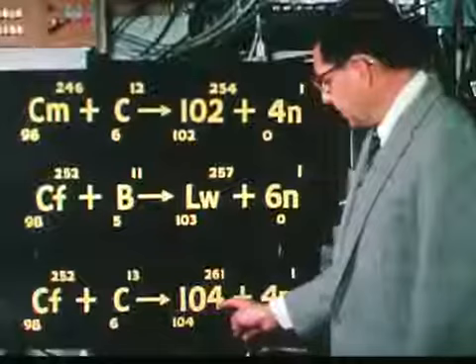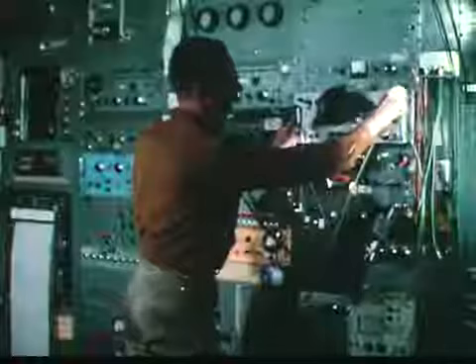The isotope that we will try to find is short-lived, and we will try to detect it in this apparatus. With this instrument, called a velocity selector, and its related electronic equipment, we can detect and record the decay of even a single atom of a radioactive element whose half-life may be so short that it cannot be identified by elution behavior. The electrical impulses from this detector are piped to the counting area where they are amplified and analyzed in various ways. The probability of causing the nuclear reaction to make an isotope of element 104 is so small that we may have to bombard for hours before seeing even a single decay event.